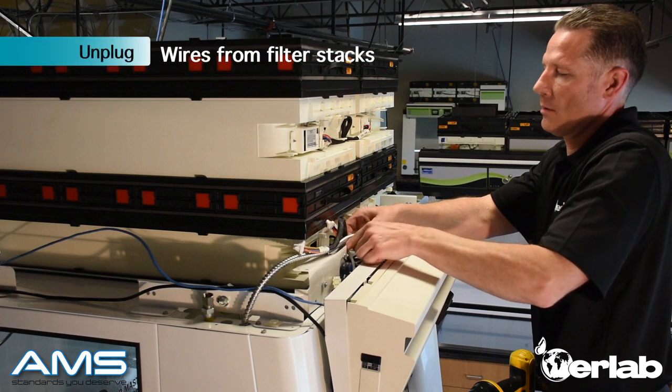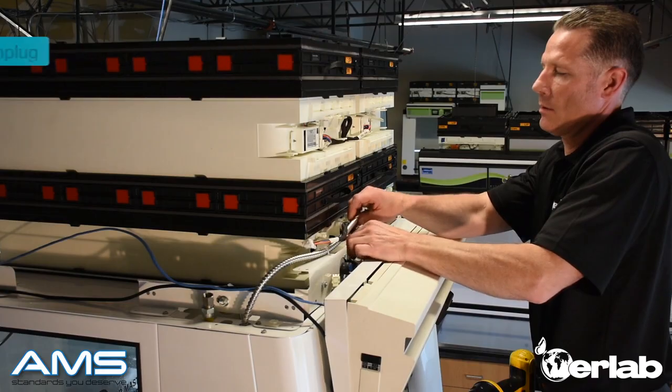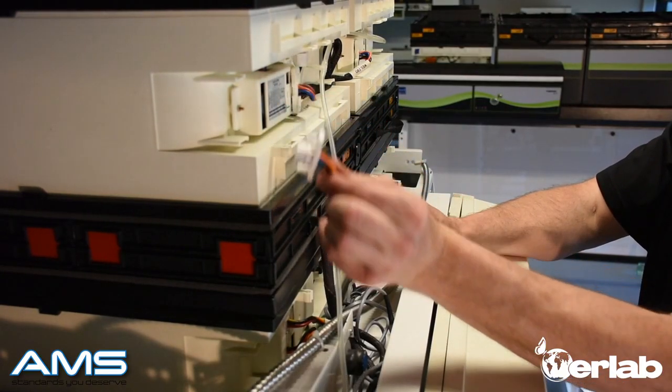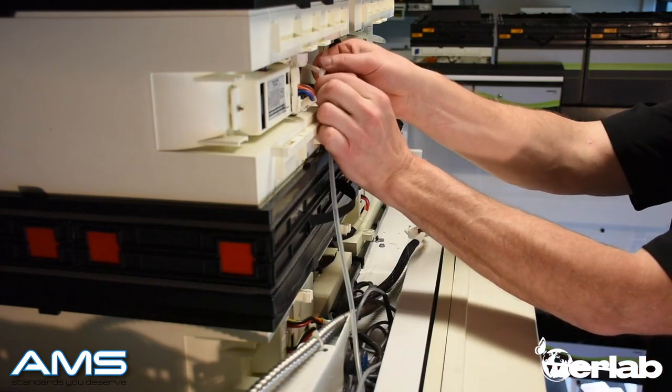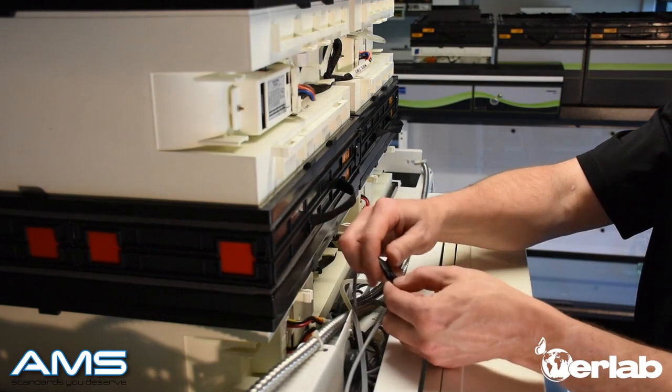With your fume hood powered down and unplugged, let's go ahead and remove the wires from the filter stacks. Start by unhooking the fan wire — grab it securely and pull out. Also grab the tubing and pull down, making sure you support the other end. Then unhook the sash sensor.